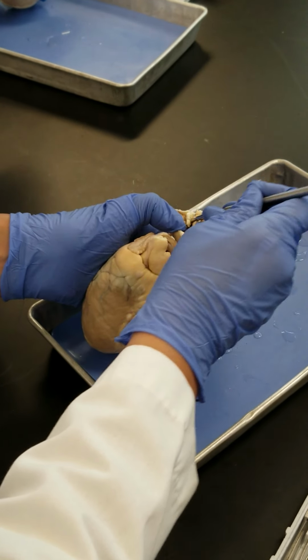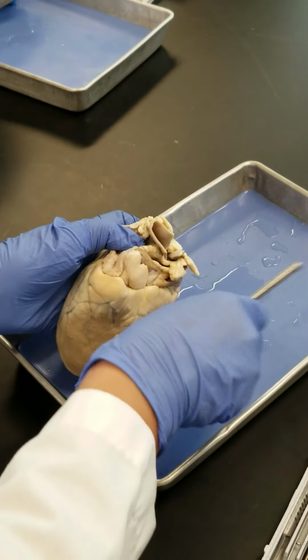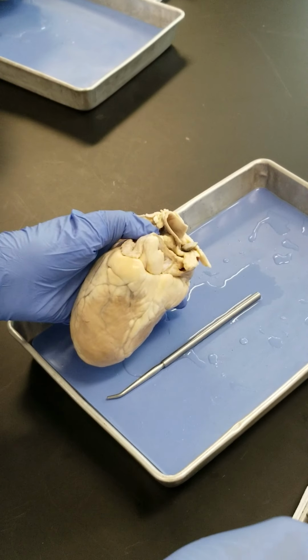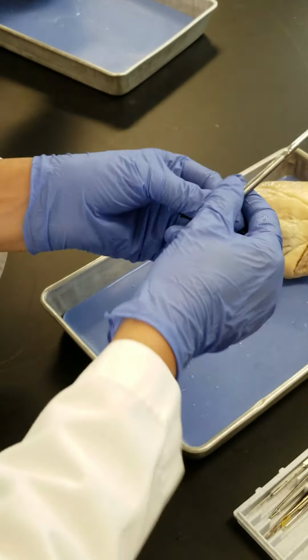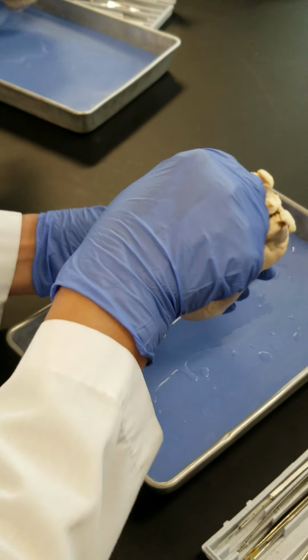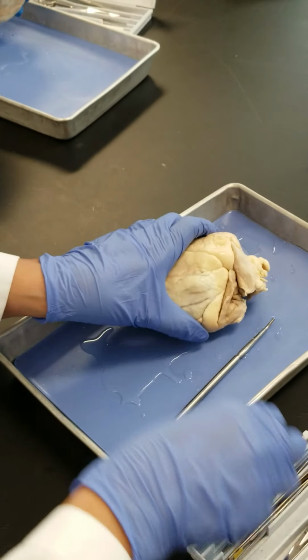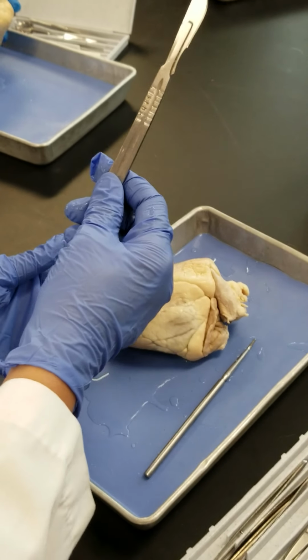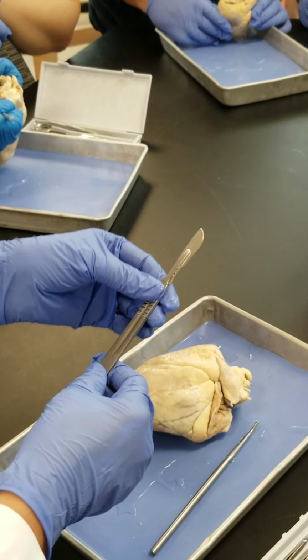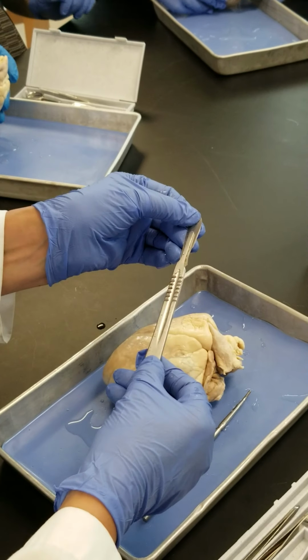When you go and look into that, you can separate it a little bit. Oh, I forgot about these dissection tools to explain to us. This is a probe that you use mostly for pointing, finding, and going through the holes and all those things. And you have the scalpel. This is a scalpel that has a blade and a handle here.